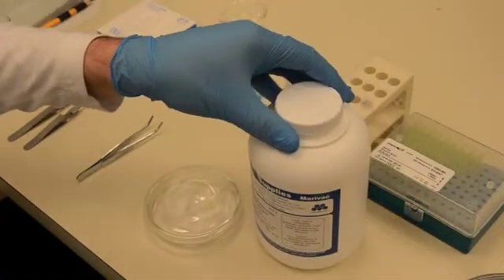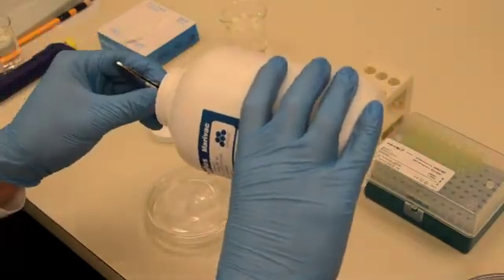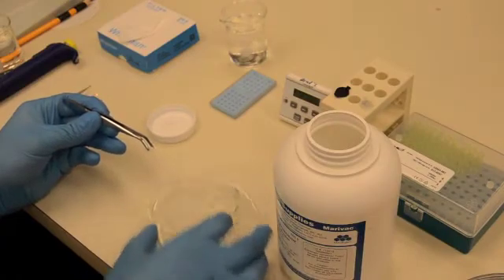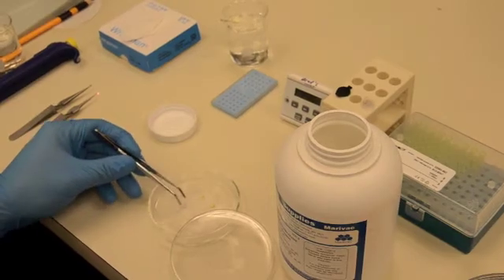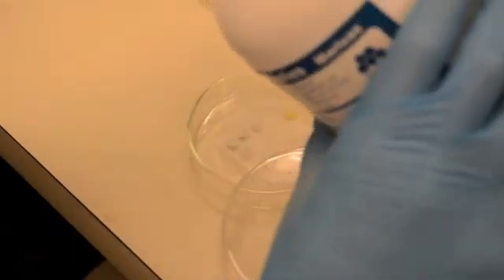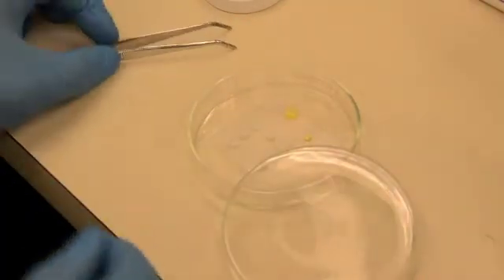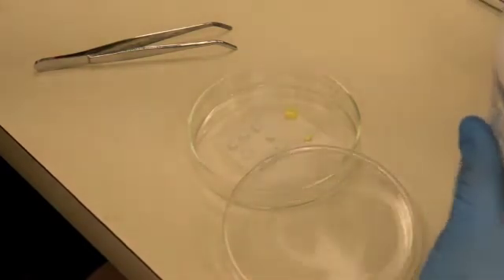While the grids are drying, prepare for lead citrate staining. Place several sodium hydroxide pellets onto a clean area of the parafilm in a square formation. Ensure that you leave space in the middle and cover with the lid. Let that sit for a minute or two.